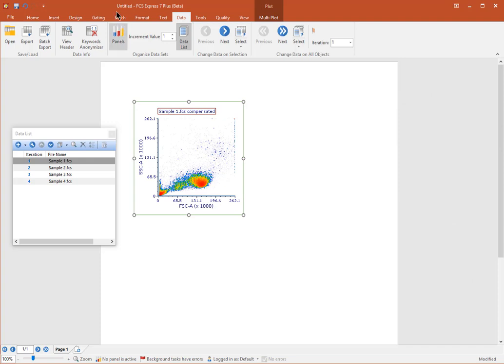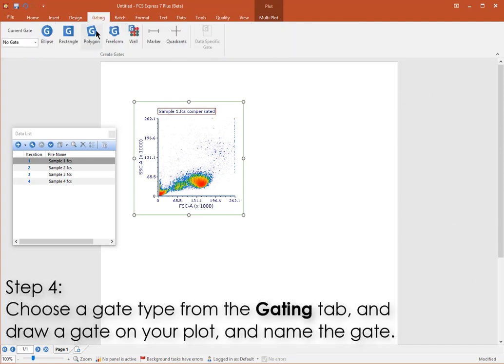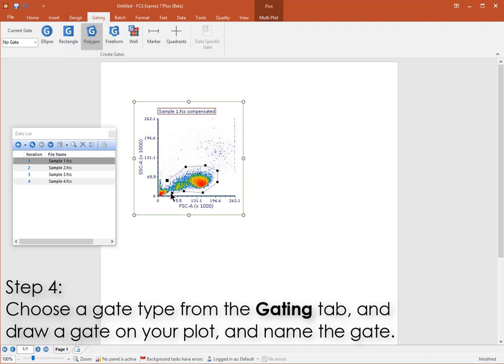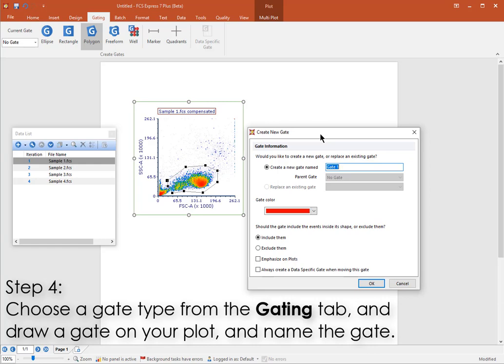Now it's time to create a gate on your plot. From the Gating tab, choose the gate type that you want to use, such as Polygon. When using Polygon, click once on each vertex, and then click on the original vertex or press space on your keyboard to close the shape. Give the gate a name.